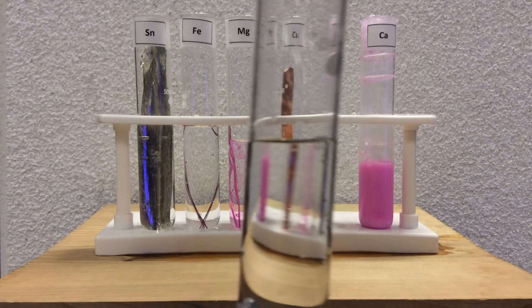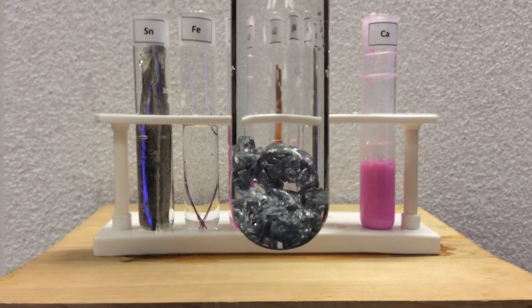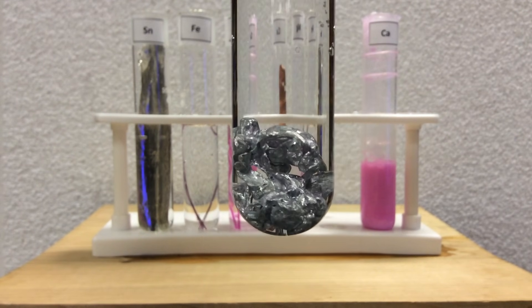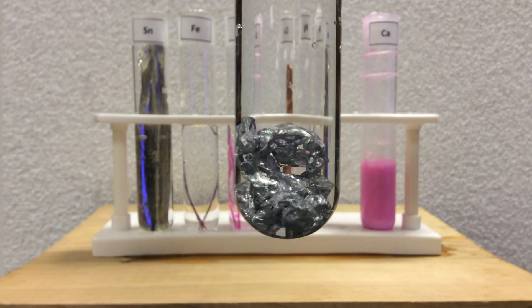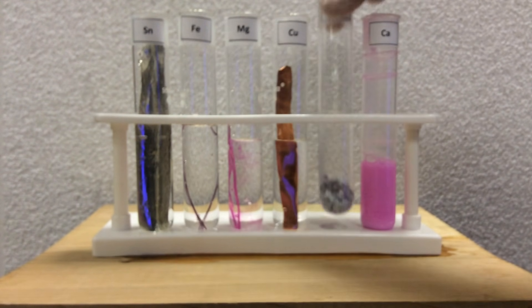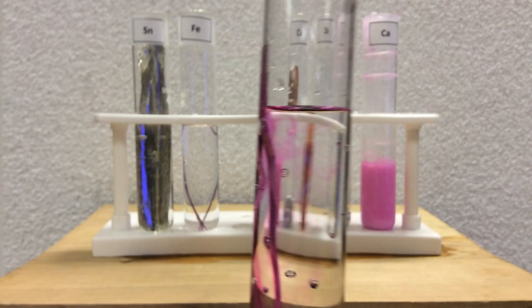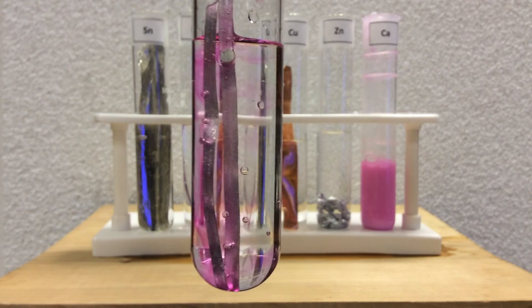Let's look at the zinc, which did react in the acid, so we suspect that there should be some reactivity here. And very hard to see any pink going on here, so we're going to let this sit for about a day to see if there's any change. Again, the rate of reaction is not tied to the spontaneity.